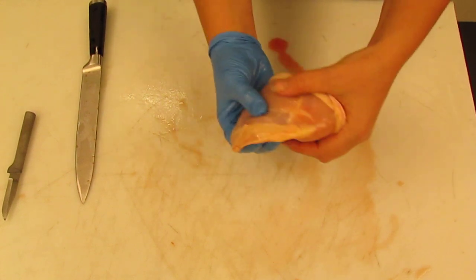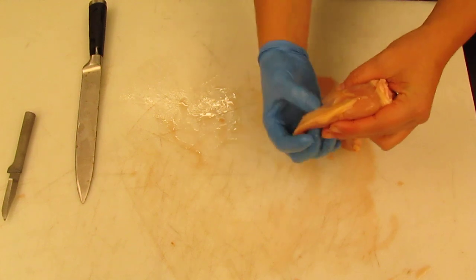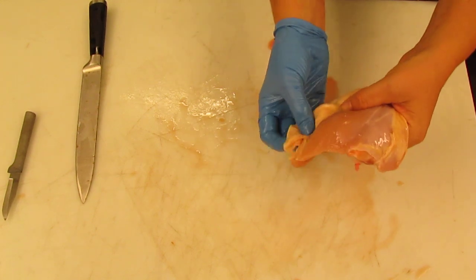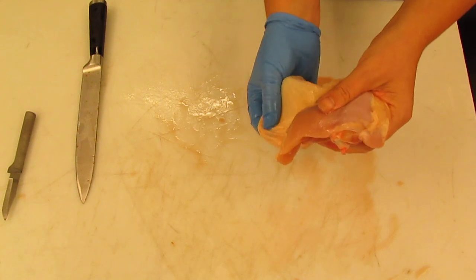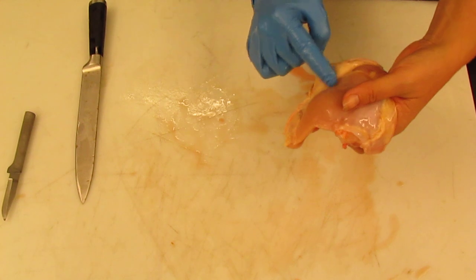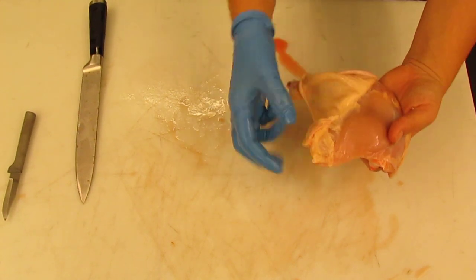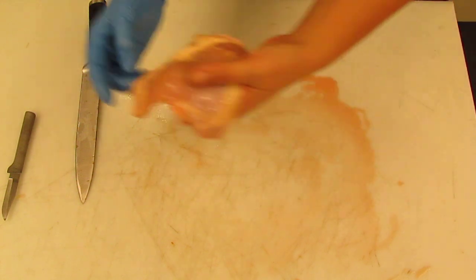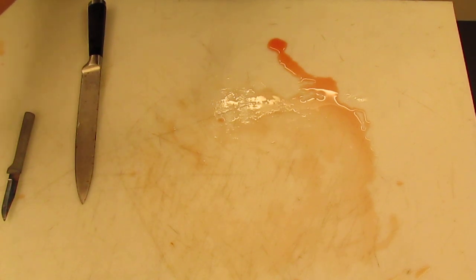All right, in certain places, such as along the anterior thigh right here, and along the posterior thigh, it's going to be a little bit harder to pull the skin away. And essentially, this is where the chicken has a lot of extra fat. Okay, so this here is loose adipose connective tissue. We can see that it's a different color from the muscle. Okay, adipose tissue right here.